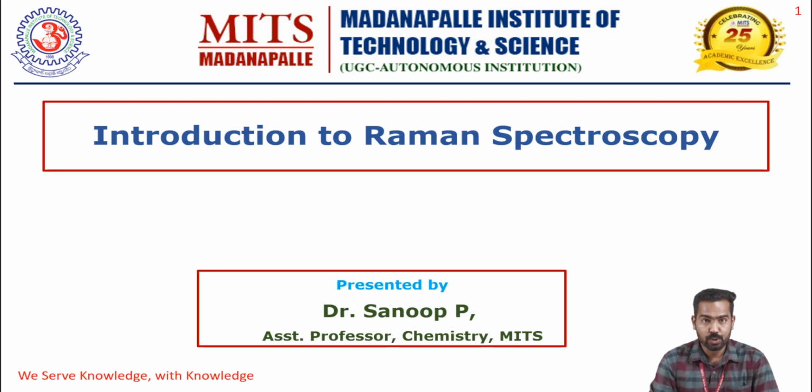Today, I am going to discuss one of the important topics, the introduction of Raman spectroscopy. Actually, this lecture session I am planning for graduates, those who are in chemistry or those who are in science and engineering streams. This lecture contains mainly what is spectroscopy, what you mean by Raman spectroscopy, and its various applications.